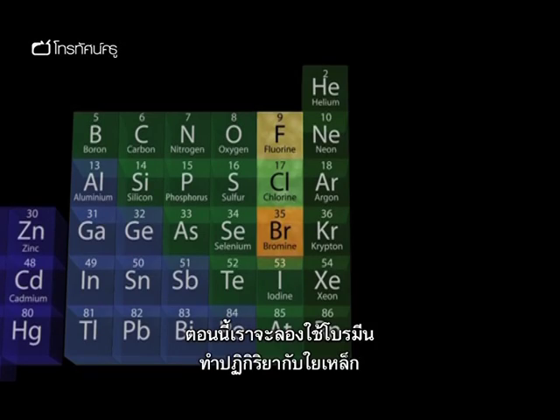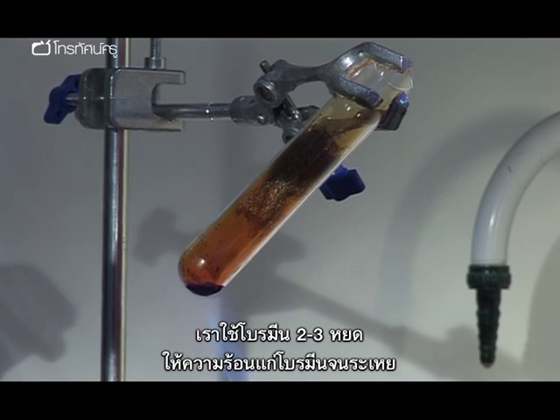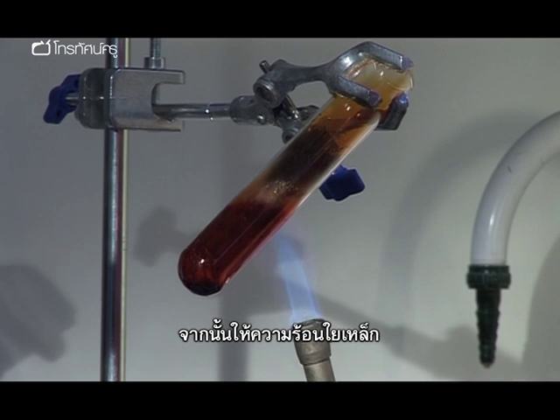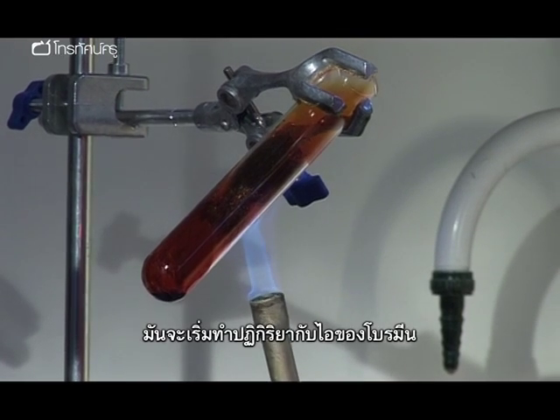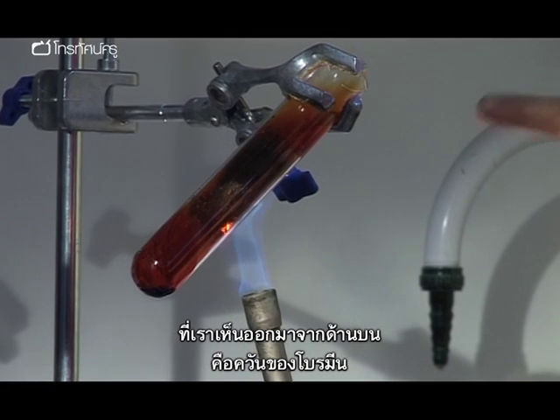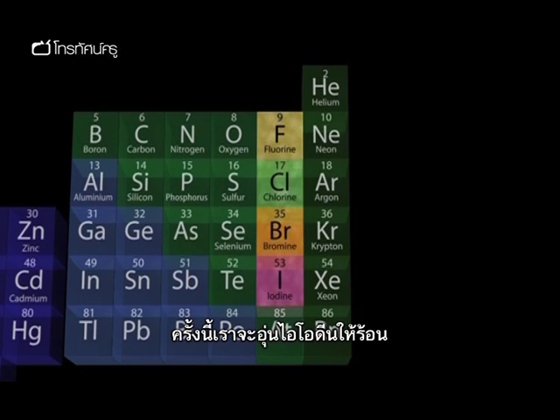Okay, this time what we're going to do is use some bromine to react with the iron wool. We've put a few drops of bromine liquid, so I'm just going to warm up the bromine to get it to vaporise, and then heat the iron wool, and what we should see, once we can get the iron wool hot, is that it starts to react with the bromine vapour. At the moment all we've got coming out of the top is bromine fumes, and there you can see the glow and the reaction.